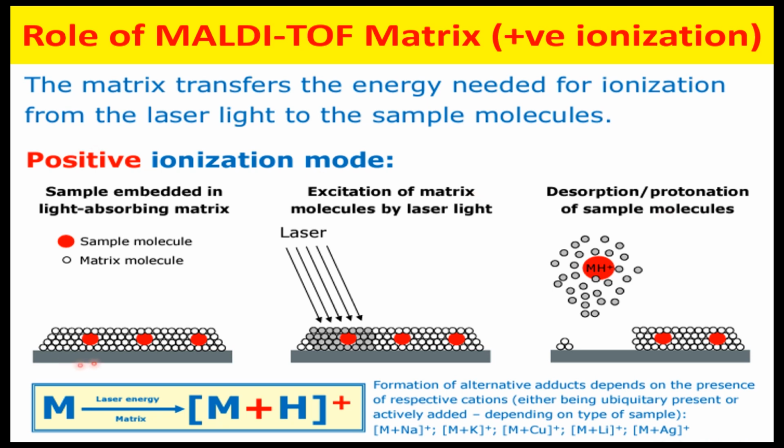See here, the sample molecules are indicated with red, surrounded by matrix molecules, and then the laser is incident on this matrix along with the sample. Then it gets protonated.